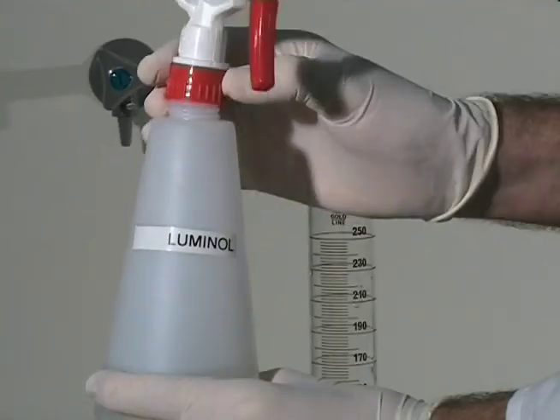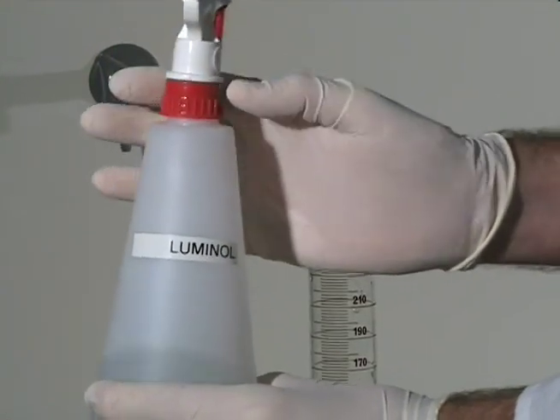When luminol reacts with hydrogen peroxide, it produces energy in the form of light. But this reaction is very slow and you might not be able to see the light.